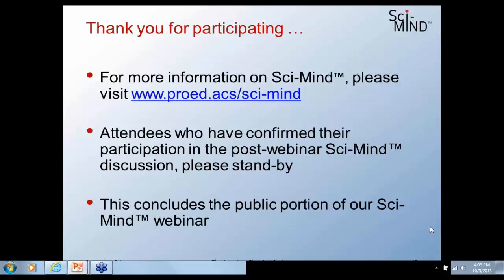Let's see, having experienced the unpredictability of catecholamine, EPI, NE, and DA extraction from biological samples, urine and blood, I think internal standards have to be strongly considered in such cases. You bet. I work a lot with urine and blood samples, and I agree 100%, internal standards are a great way to go, because you're almost always going to be doing a complex extraction scheme prior to your chromatography. And the internal standard will help you to account for some of that variation. I still like to do the external calculation, though, because that helps me to understand how much variability I am getting from that extraction method.